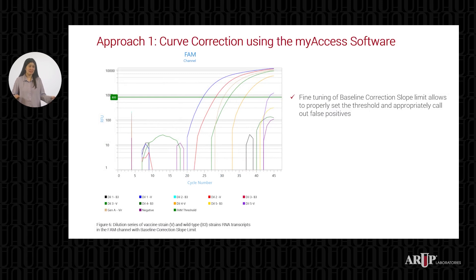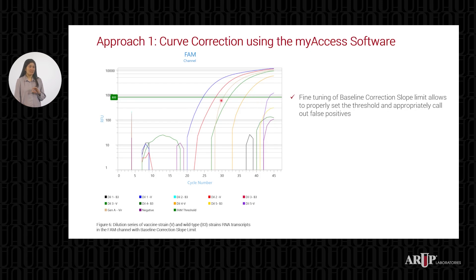This plot shows the same set of data analyzed with different analysis settings. The adjusted baseline correction slope limit was integrated into the protocol and the data was re-analyzed. As you can see, by fine-tuning the analysis parameters, we were able to significantly reduce those flatter-looking curves around the baseline and we were only able to detect vaccine strain on the FAM channel. Although adjusting the analysis settings worked very well and significantly reduced the false positive curve, we wanted to further optimize the assay.